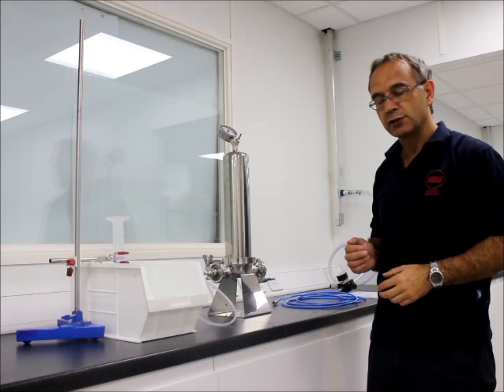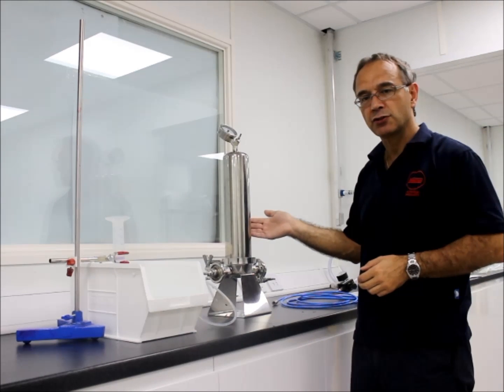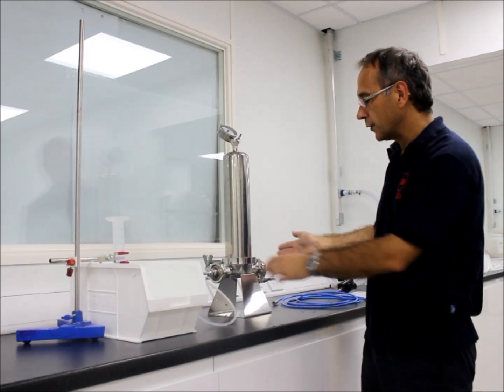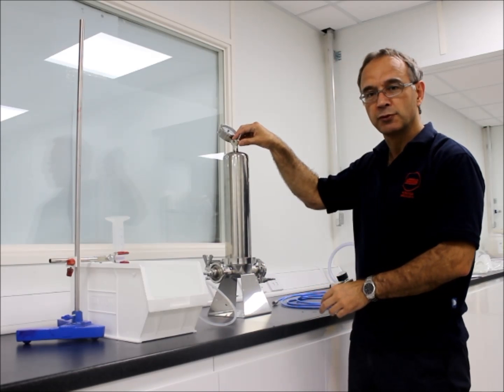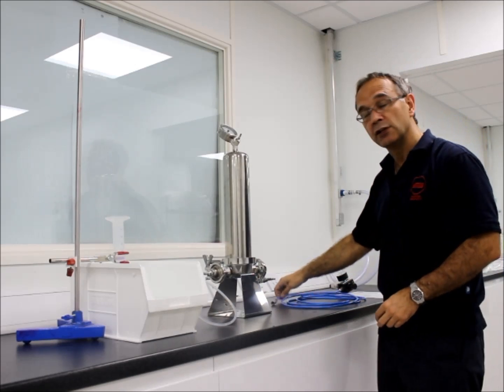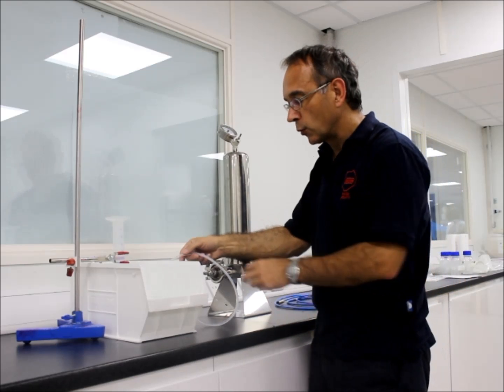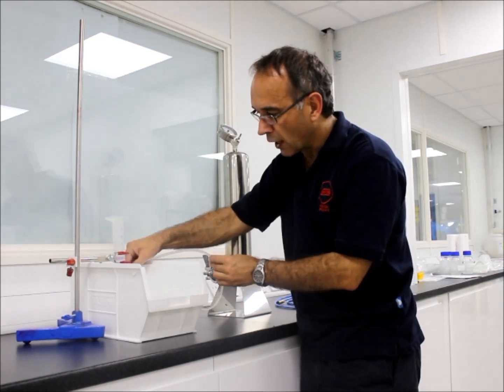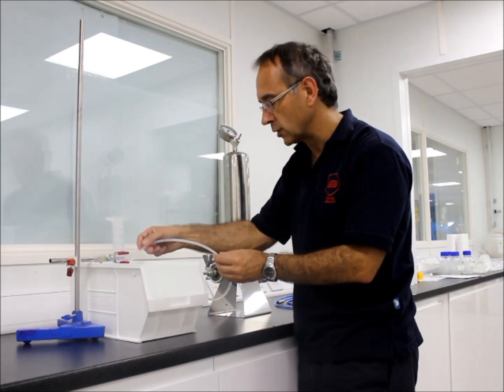The equipment we need to do the integrity test is relatively simple. All we need is a housing, and inside this housing is the filter that we wetted earlier on. The inlet to the housing needs to be blanked off, and we need a connection at the top to enable us to connect a compressed air supply. On the outlet from the filter we need a tube, and we're going to insert that tube into an inverted measuring cylinder which is full of water, which will allow us to measure the flow.